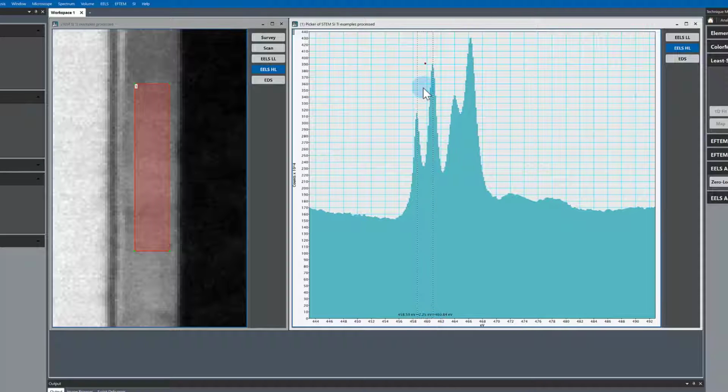So we could expect to see differences if we had different symmetry, so tetrahedral or octahedral, or maybe the nearest neighbor distance changes. So this crystal field splitting energy, the difference between this peak, or this peak, and this peak, is something that could be useful to measure. So that's basically the goal here. That's what I want to try and do with nonlinear least squares.